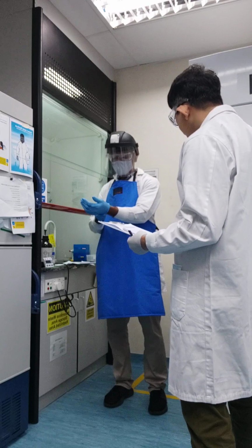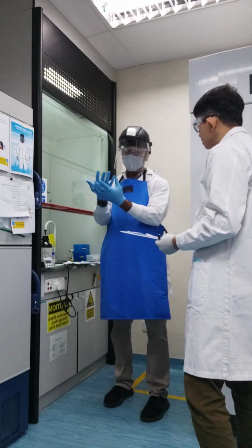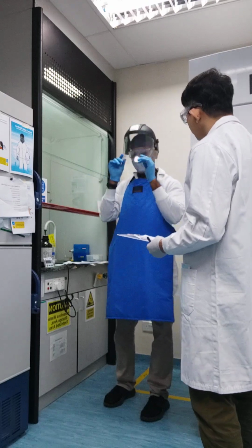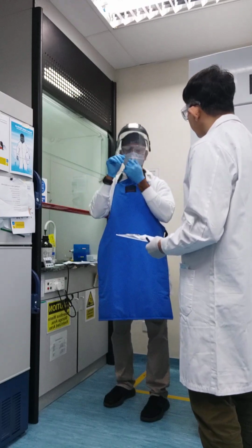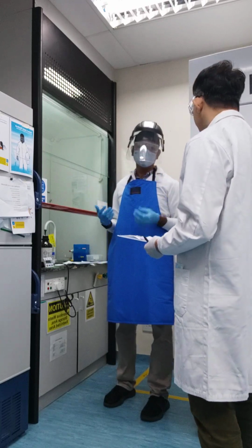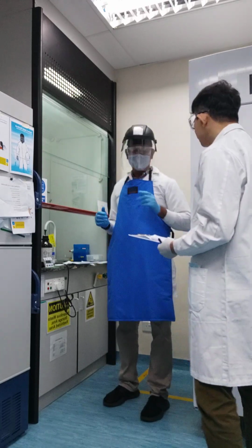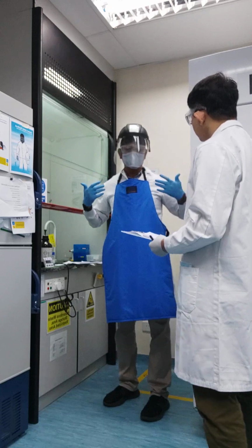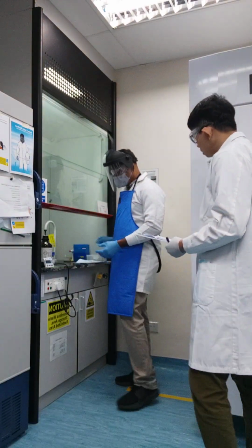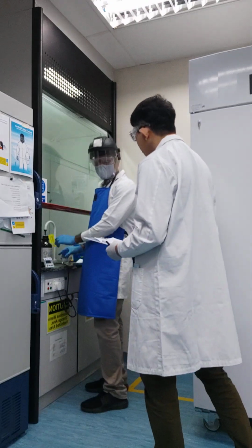And then you wear your hand protection. It's the chemical resistant glove. And lastly, you also wear your respiratory protection because it's a corrosive substance. So you protect yourself from harmful dust and vapors. After you have worn your PPE correctly, then you can start conducting your experiment.